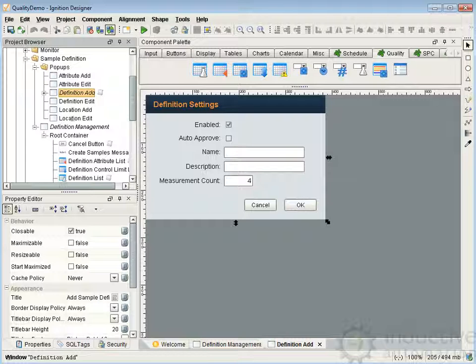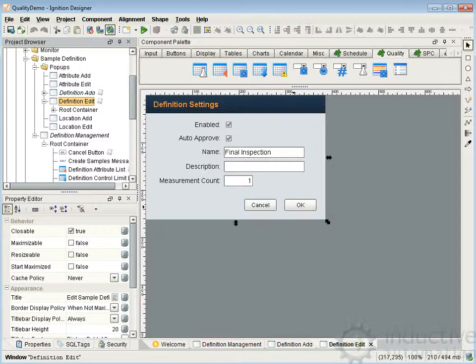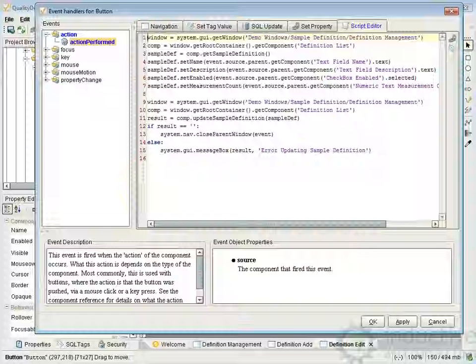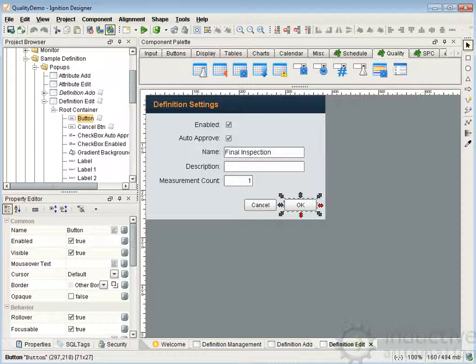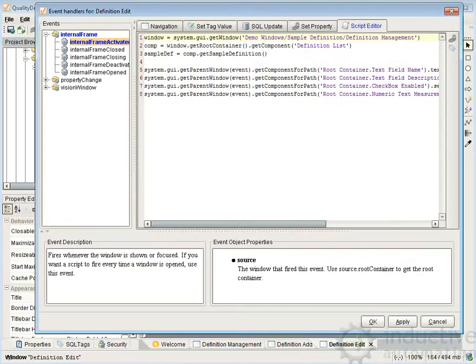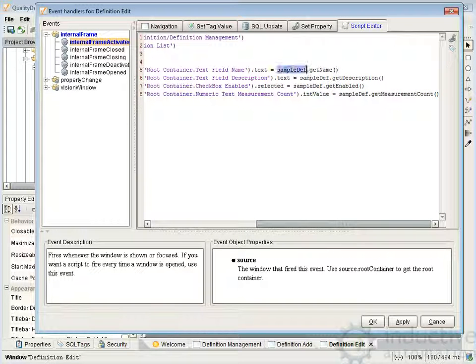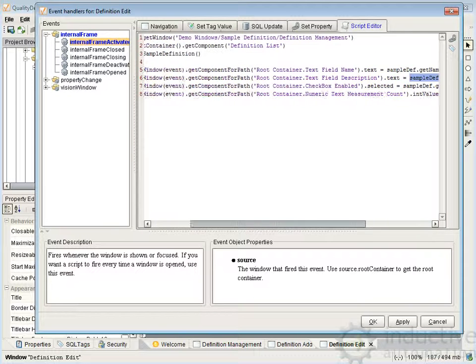The edit definition works identically, with one or two changes. Here we're calling updateSampleDefinition instead of addSampleDefinition — that's the only difference there. When we bring up the window the first time, we go out and get the sample definition — we get the definition list, get the currently selected sample definition — and then we set the entry fields on the screen so that when you edit, the existing settings are displayed.